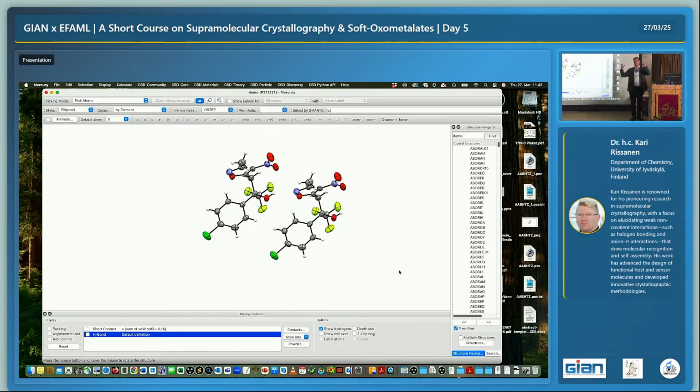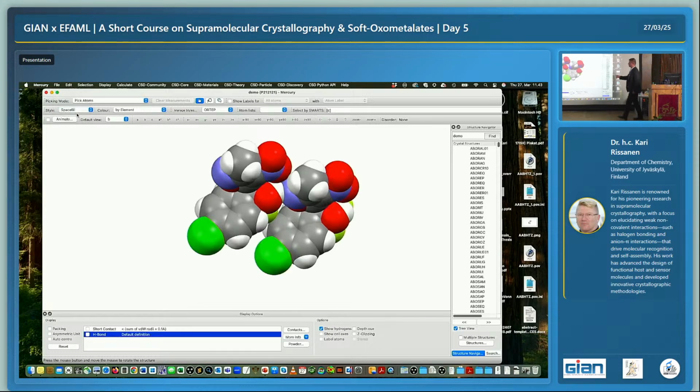But it seems that the atoms are floating very far away. But that's not the case, because when you click here, space fill, you see now that this hydrogen is interacting, hydrogen bonding to this one. When you're using the space filling, you can really see the bond. Not just a number, you can see it visually. This is how it goes. So now let's reset.